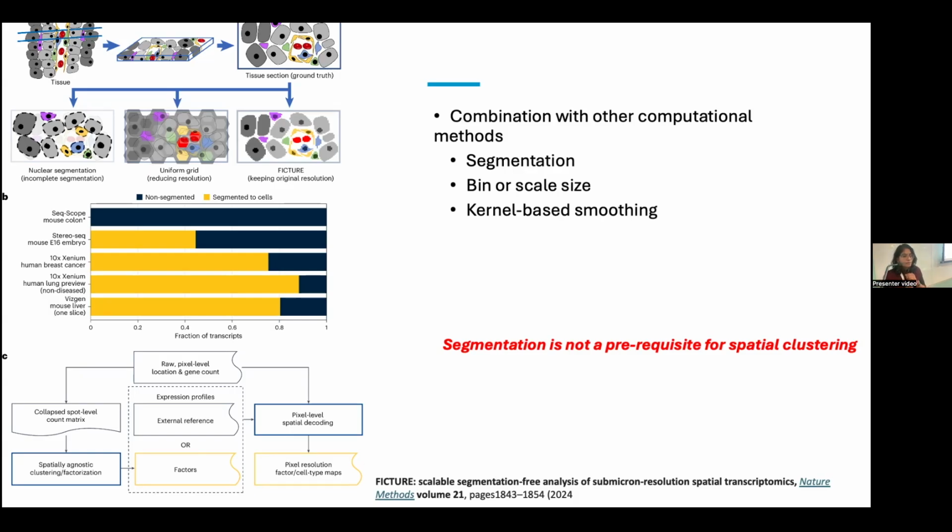Now, whether segmentation will improve your spatial clustering, I have avoided segmenting any Visium HD. And truthfully, you don't need segmentation. You can see the domains, you can see your clusters, you can see those spatial patterns without segmentation. And it's probably the easier route to take before you segment. You only segment if you feel that there is value to it.